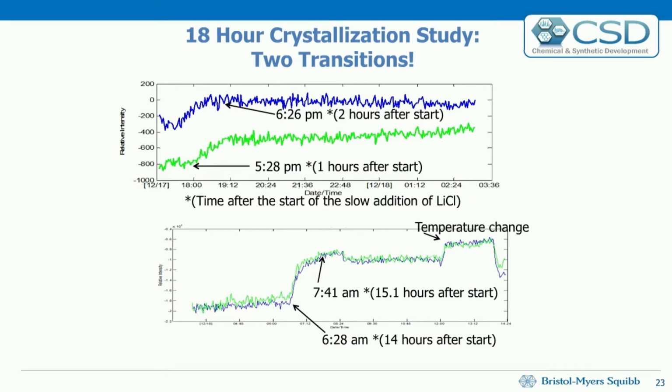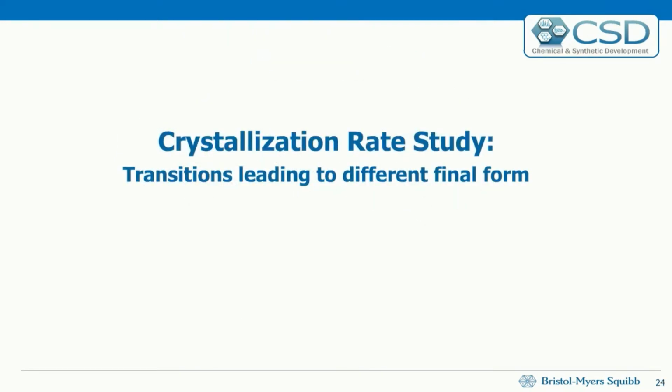Now you can go back and customize. You can shorten it, you can lengthen it, you can isolate those different crystals, and then characterize the different forms. That helps with the patentability, that helps with your proprietary concerns. You also have to be able to file all the possibilities, and you need to test them for bioavailability, solubility, and so on. So it's a great tool to get into the intricacies of crystallization.